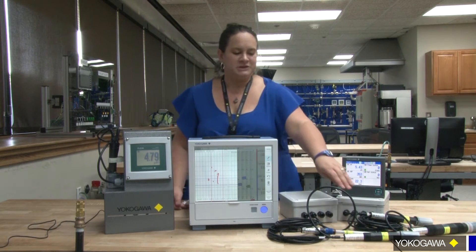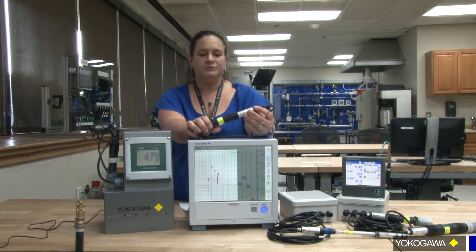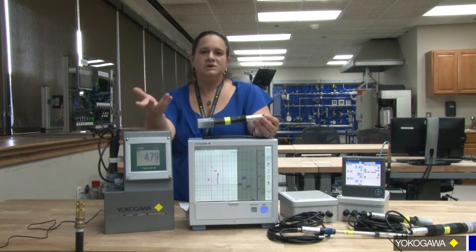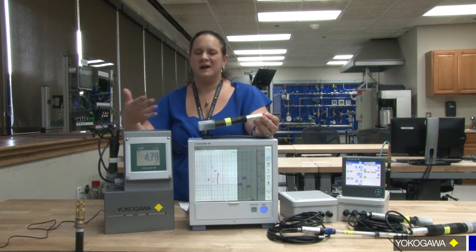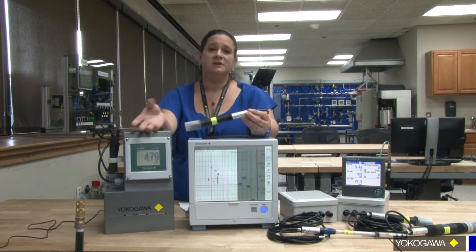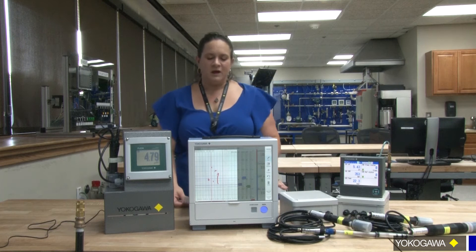Now all you do is take one of these pre-calibrated sensors that's sitting in your instrument shop or in your lab on the shelf, take it out, take the one out of the process, and swap it out. Whereas before you may have had 30 minutes worth of cleaning and calibrating, now you have maybe 5 to 10 minutes depending on how intense the installation site is. And then you can take the sensor back to your lab or instrument shop and calibrate and clean it when you have time. So there are benefits as well.